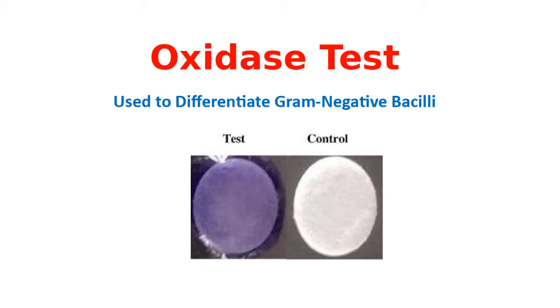You're still responsible for the material, but I know after the test you may not want to think too much about technical things, right? And these are pretty technical. Okay, so we're going to do this first, and then we'll have time to talk about a review if you guys want to. So we start with the oxidase test.